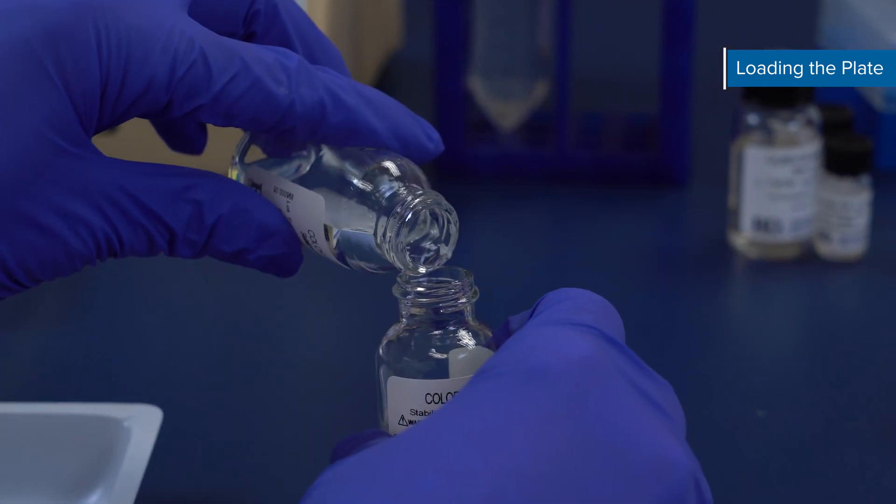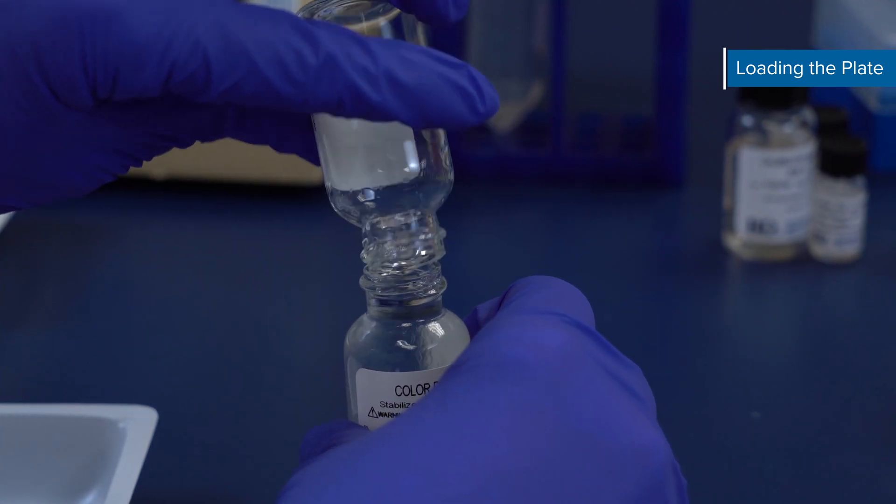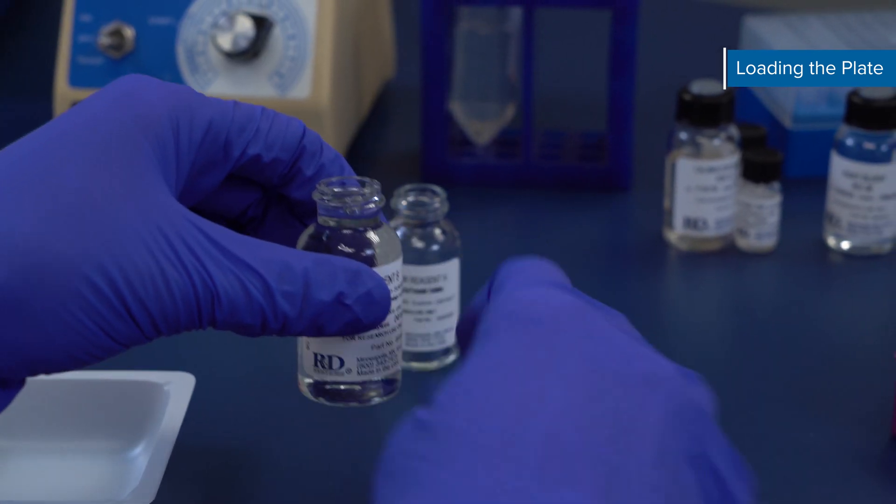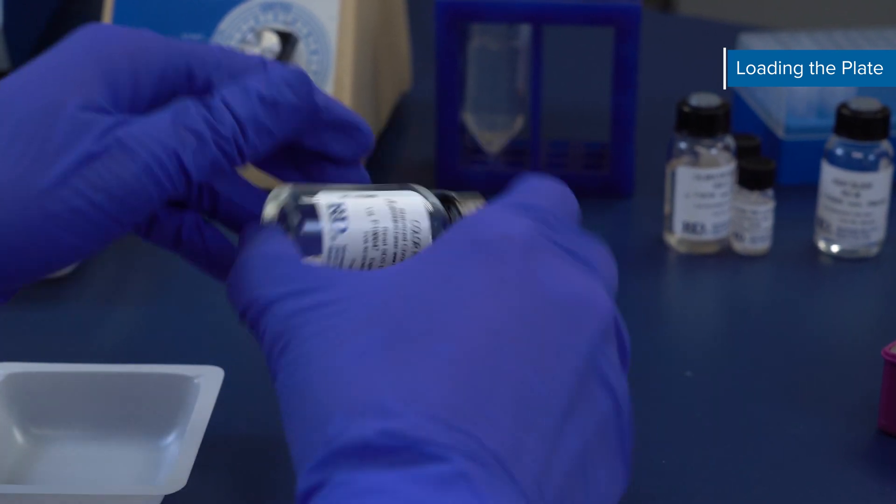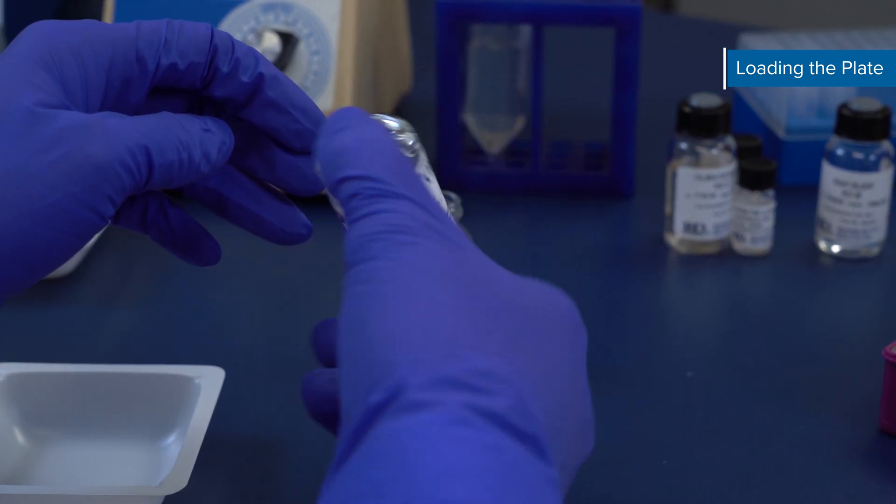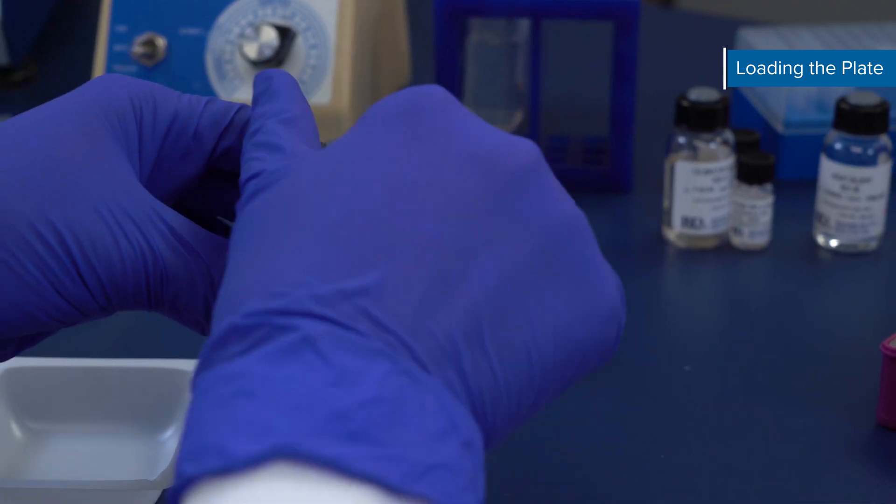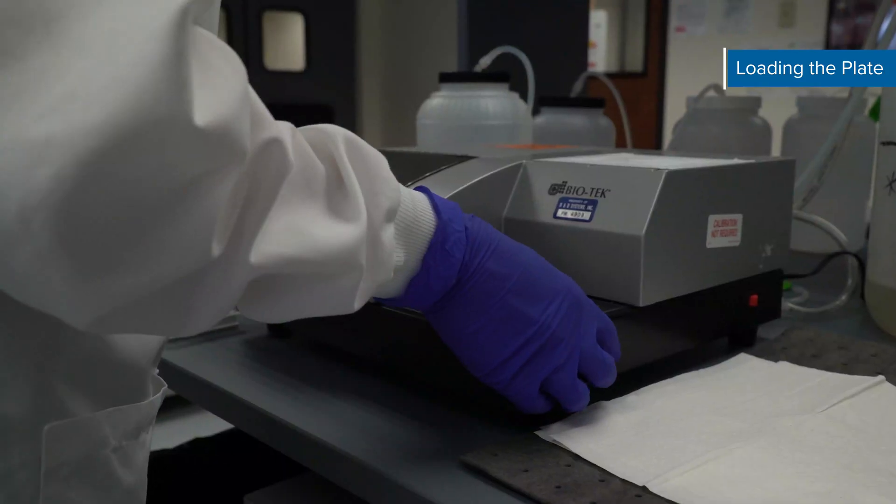In the last five minutes of your incubation, prepare your substrate solution. Mix together color reagents A and B in equal volumes. This substrate solution must be protected from light and used within 15 minutes. It should remain colorless until added to the plate. 100 µL of the solution is required for each well.